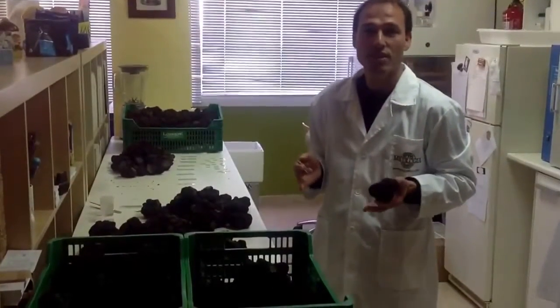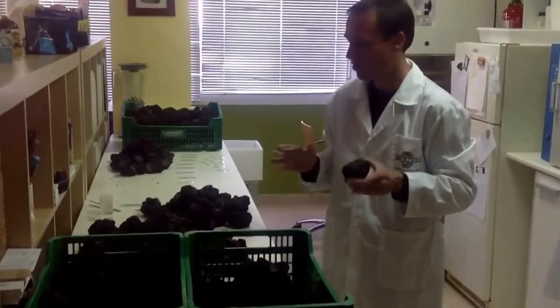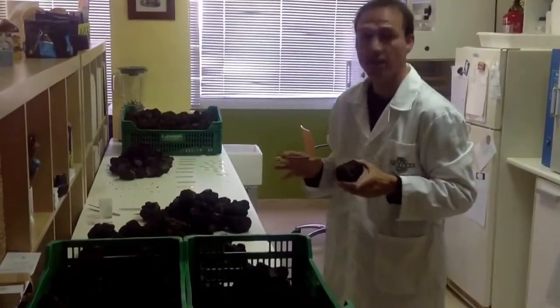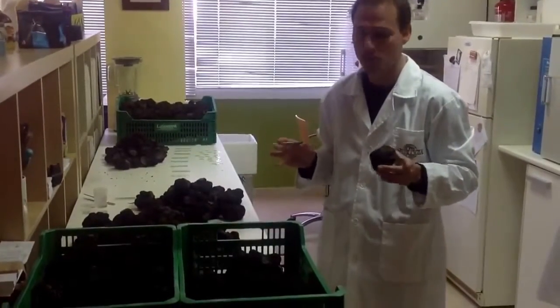Today we receive at Mycologia Forestal Aplicada 43 kilos of black truffle that we want to check and analyze if they can be used for inoculum, and we want to explain how we do this process.